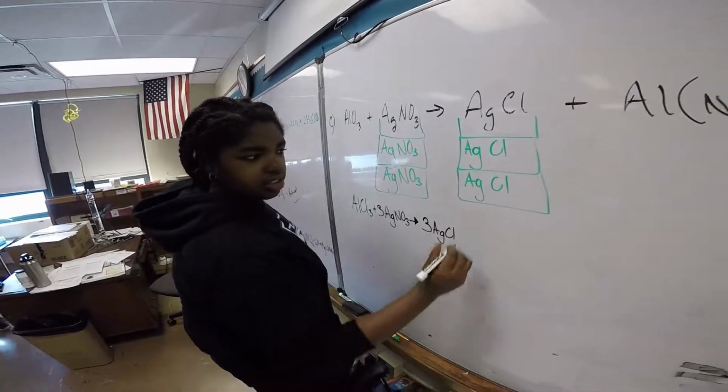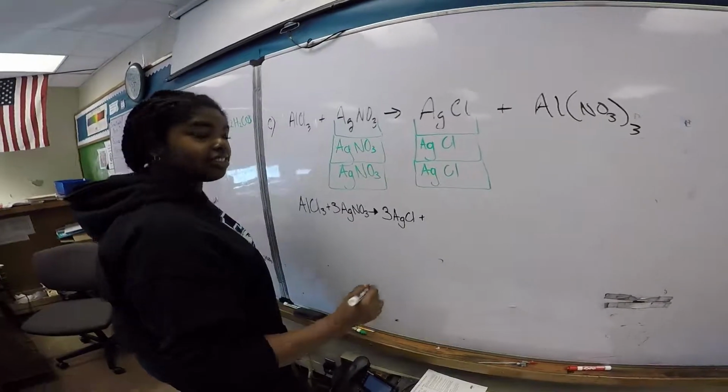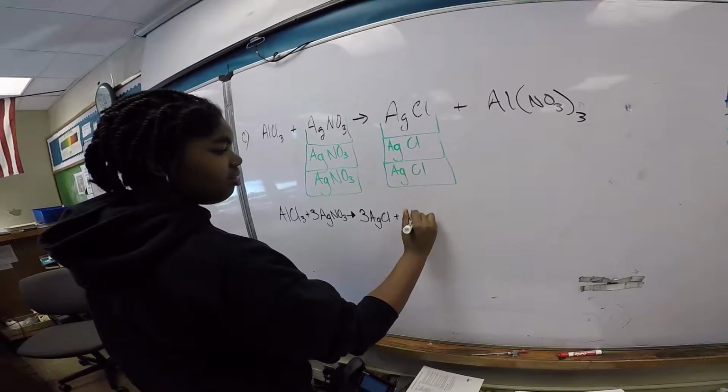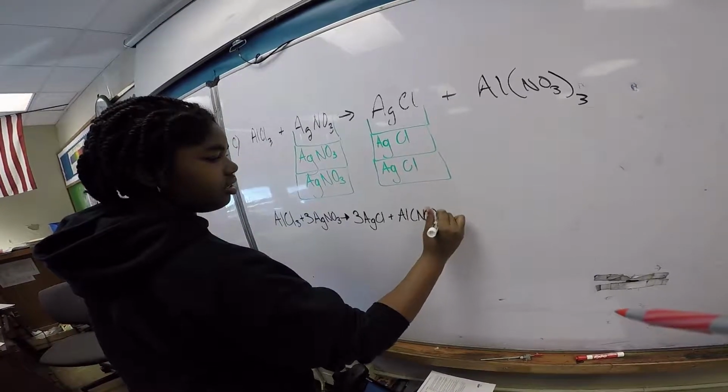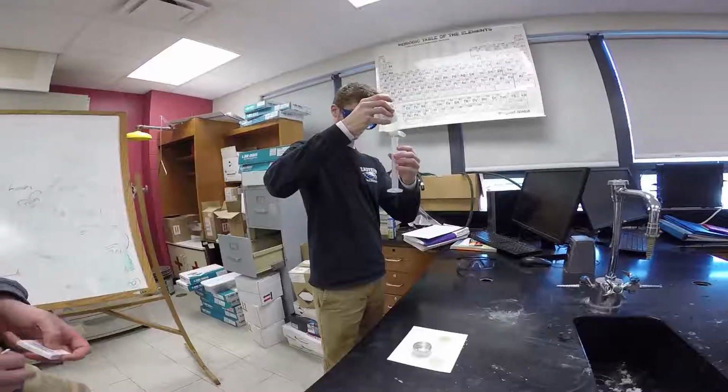Am I doing this right? Yes, it's perfect. Excellent. Wait, what? I'm actually doing something right? Yeah, it is correct. 100%. Good job. That never happened in this class. Oh, that's not true. I'm getting you on video right now doing it by yourself.